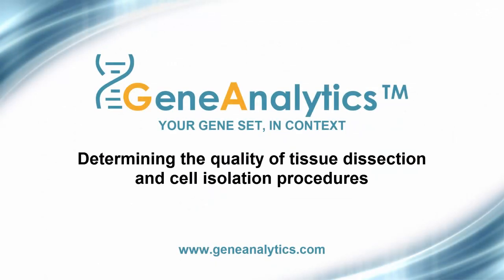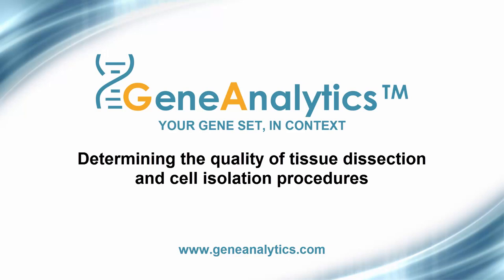In this test case, we showed you how Gene Analytics can identify impurities in cell populations based on our manually curated, filtered, and annotated gene expression data. As such, it is a powerful tool for assessing the efficacy of biological sample isolation.